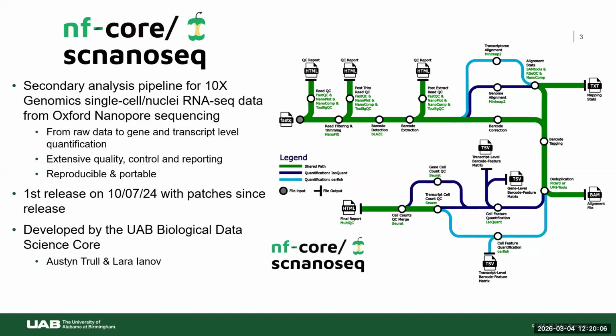Things like how many cells were detected, how many features were detected, as well as how many reads per feature. So this is essentially what this is doing. We combine Seurat as well as the metrics from SAMtools to compile a custom table that we output into the MultiQC report. We also have some high-level plots, which don't go into the MultiQC report, but are present in the results.